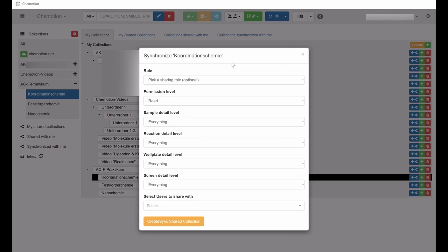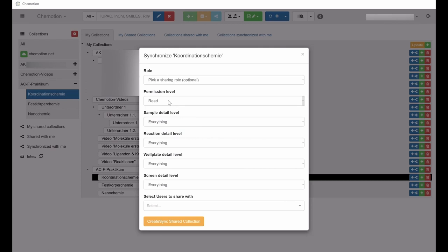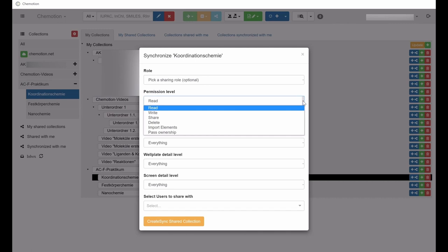Here, you can define individuals and groups with whom the collection should be shared. In addition, access privileges can be specified which determine to which extent individuals are permitted to access the content of the collection.